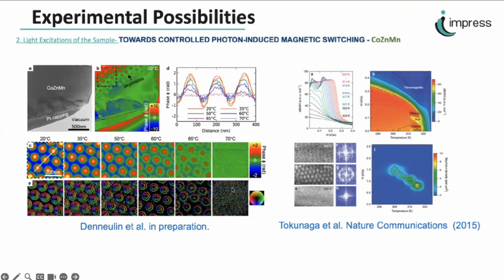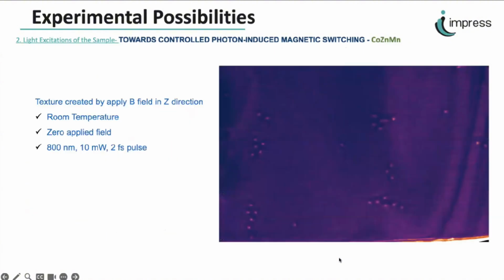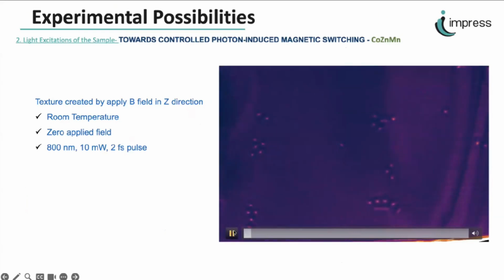There have been some studies on this material system to characterize its magnetic properties, but here we are focusing on, again, a similar experiment. This is a single shot experiment like the DTEM experiment that I explained before. When we send single pulses, we can manipulate single skyrmions, clusters of skyrmions, or very small lattices.